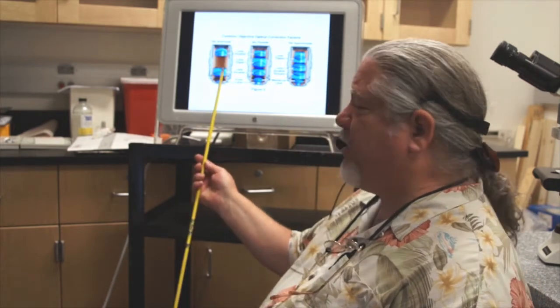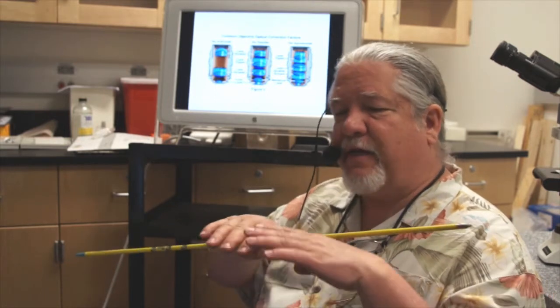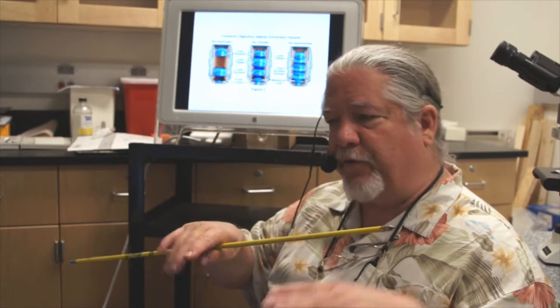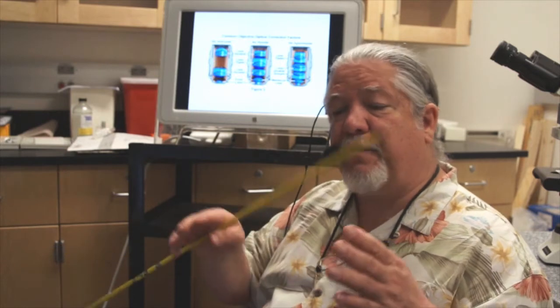It's also not corrected for chromatic aberration, which we'll discuss in a second. An achromat would give you an image that maybe looked like a pincushion. We would want to choose a plan achromat that gives us a nice flat field of view. They don't show a plan achromat here, but understand that we're corrected for flatness of field so the entire field is in focus from edge to edge. Achromat is the least expensive objective, then you go to plan achromat.